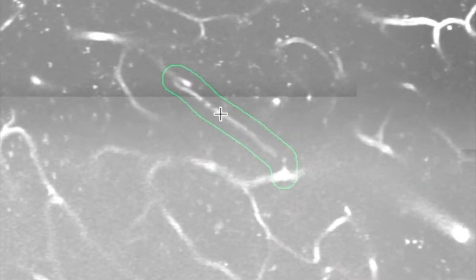This is another beginner video. As we scroll through, we see several instances of the red blood cells being stuck in the vasculature, as shown here. One thing that might be a little confusing to users is this line, which previously mentioned just indicates where the stitching of the images occurred. And it's normal to see and shouldn't interfere with any of your analysis.